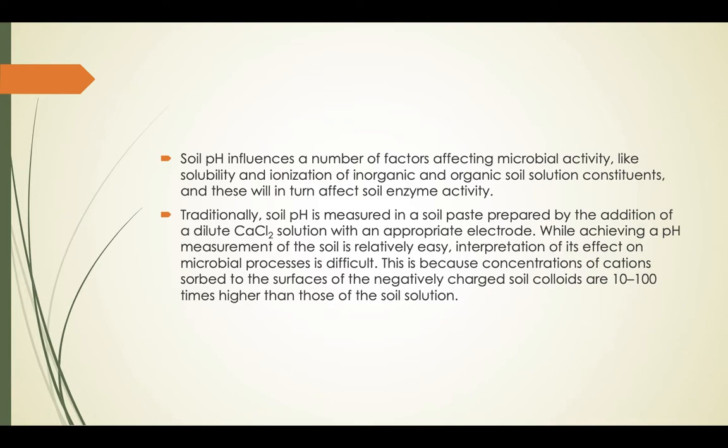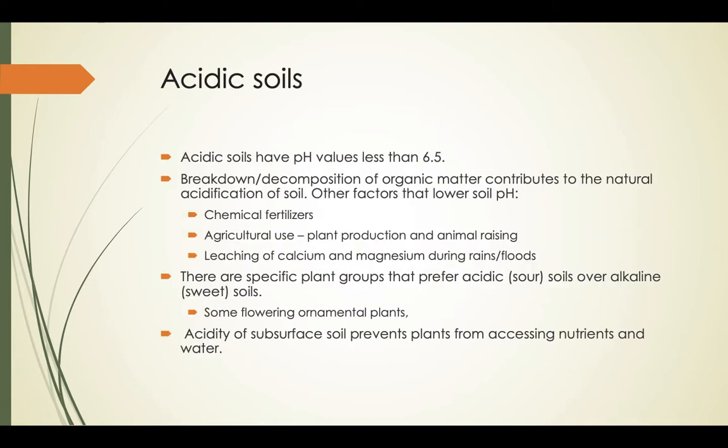All the more reason that you really need to use composite sampling instead of just the traditional direct sampling, where you get some soil from a specific plot, and then you do your soil pH measurement. So the interpretation part in pH measurement, the pH reading, is going to be quite tricky, and we need to factor in other characteristics or other expected phenomena happening.